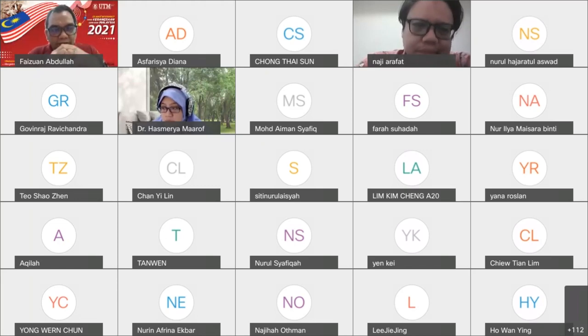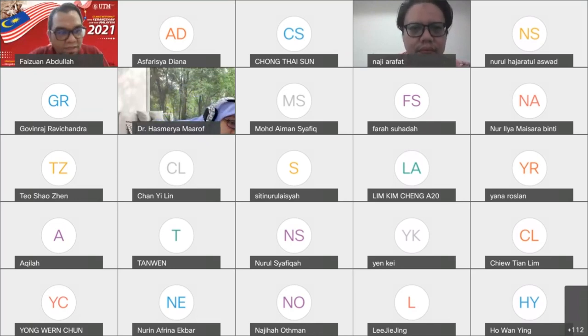precipitants. All right, if you can understand, this is why, if you do sampling of environmental samples, river water, sea water and so on, we need to preserve the sample as soon as possible using nitric acid. The first reason, for metal analysis, is to avoid the metals inside the sample precipitating with other compounds in the water or attaching to the sample containers. So we need to ensure that the metals inside the sample are freely in the form of ion inside the sample. I hope that can answer your questions.